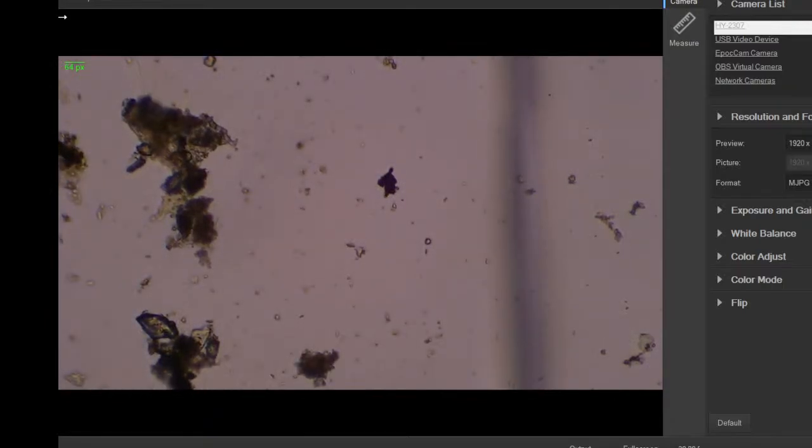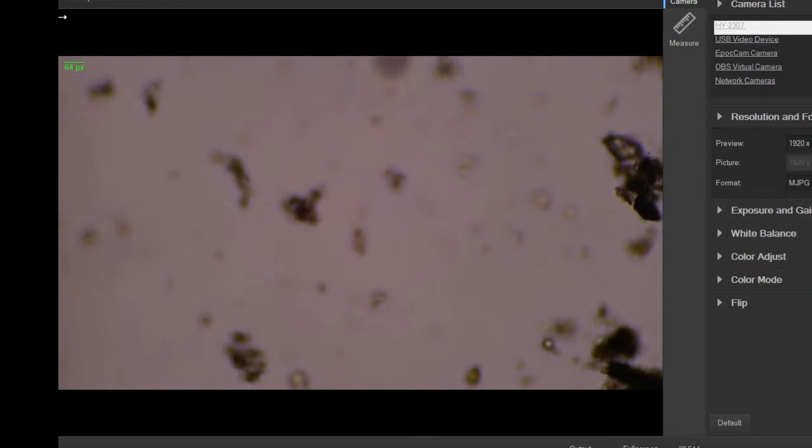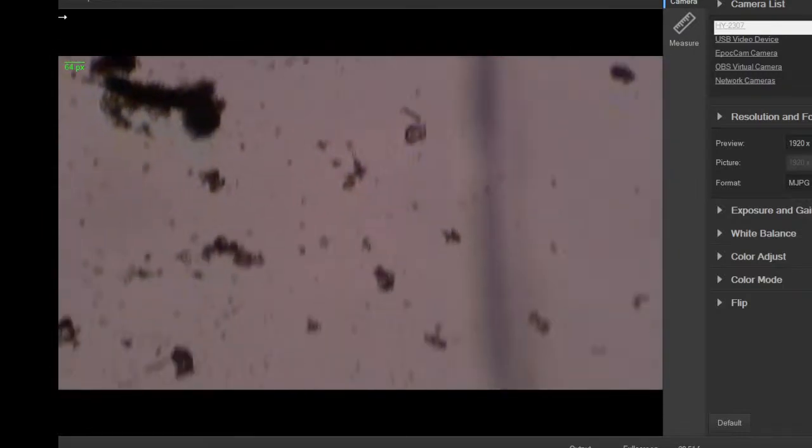Oh, these are Vorticella. Oh, nice. This is a great slide. These are sweet, free swimming Vorticella. These little cup-like things, you don't often see them swimming like this. They're usually planted down on stuff, on little stalks. Boy, oh boy, it's a fast one. I never see them swimming. They're always attached.